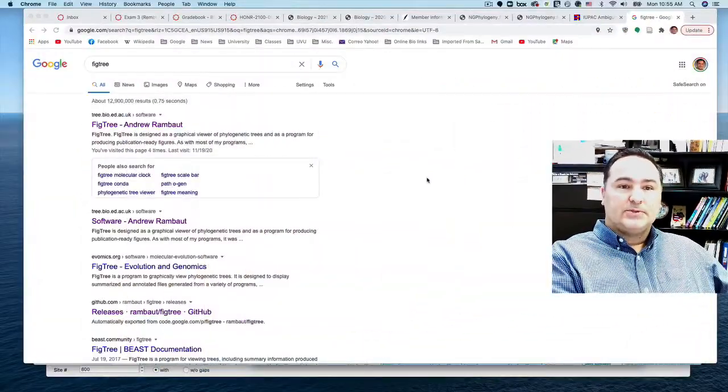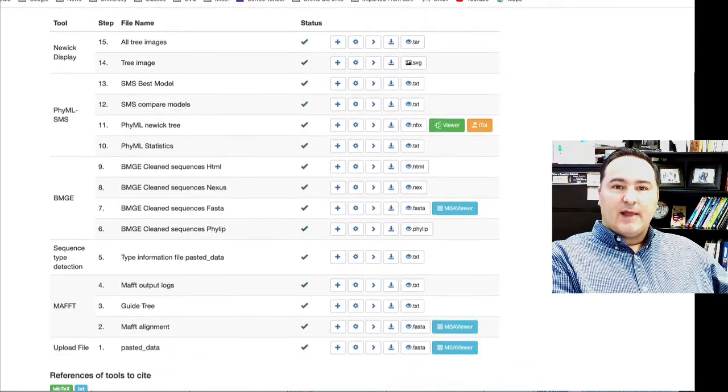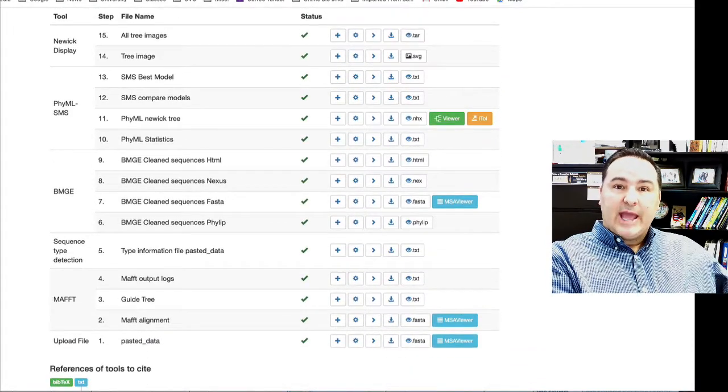Hi students, this video is going to help you learn how to manipulate the tree after you've produced your tree, so that you can make a really high quality version of that tree that can then go on your posters. Okay, so we're going to start from you've run a phylogeny analysis using NGPhylogeny, right?